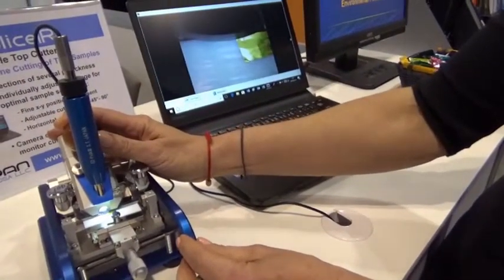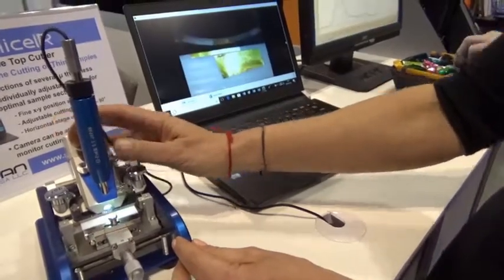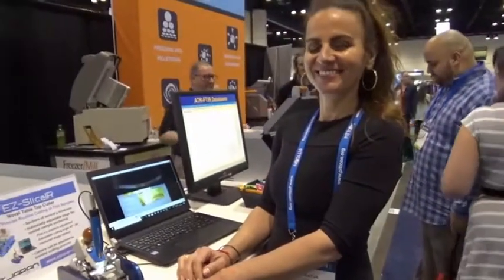You simply press down and pull it over your side and have a nice cut. Here you go.